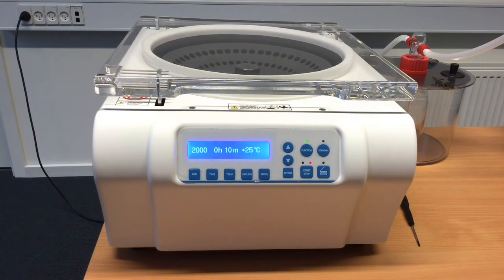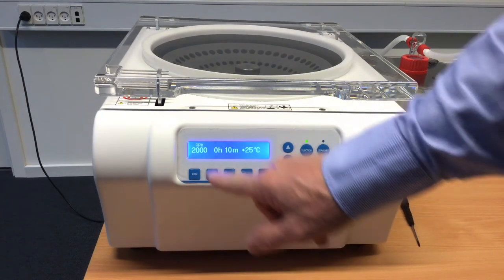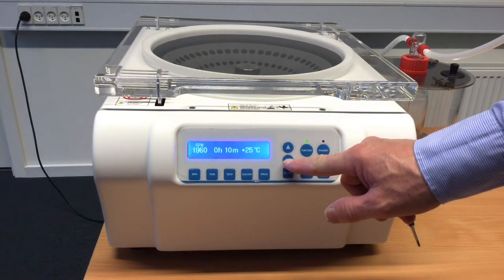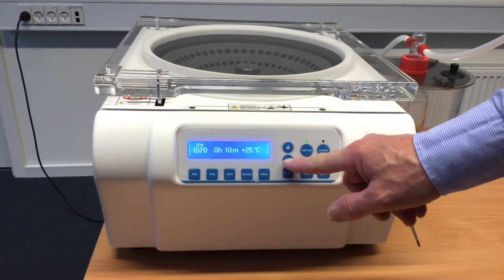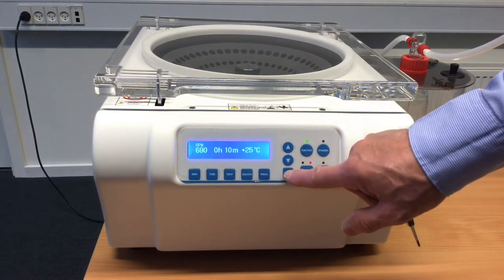When we want to change the set point, you just press enter — for instance, for RPM. RPM starts flashing and you use the up and down buttons. The maximum is 2000 RPM. Going down to, for instance, 690, then press enter.